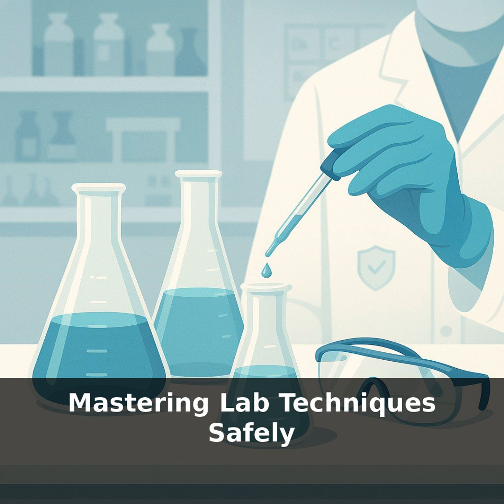At UCLA in 2008, a chemist working with pyrophoric T-butylithium transferred it in a regular syringe, outside a fume hood, wearing only a lab coat made of synthetic fabric. When the reagent ignited, the coat melted into the skin. That single event reshaped university safety programs worldwide. Flame-resistant lab coats became standard, training for air-sensitive transfers expanded, and written approval was required for high-risk reagents.